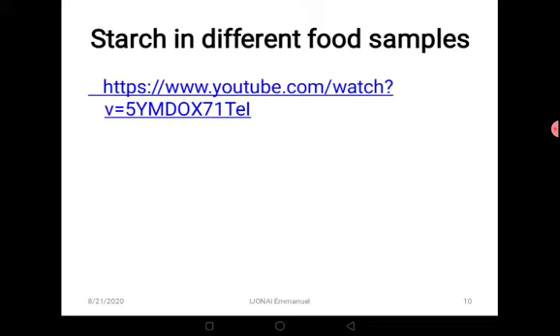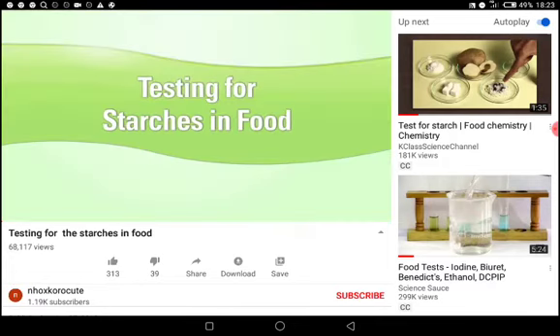It's very important because in future you would be a medical doctor or a laboratory technician in the hospital, and you will have to quantify the prevalence of the disease or the quantity of the disease parasites that are available so that action can be taken. That's why we do that at this level. So we can also watch this other video to see the different food samples and compare the amount of starch present in each. Don't forget that this is a very simple experiment.